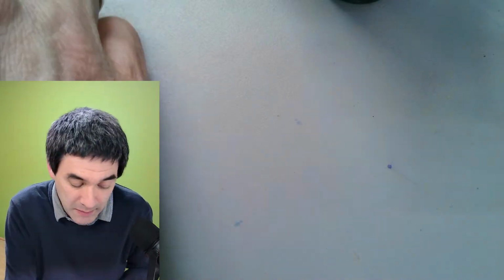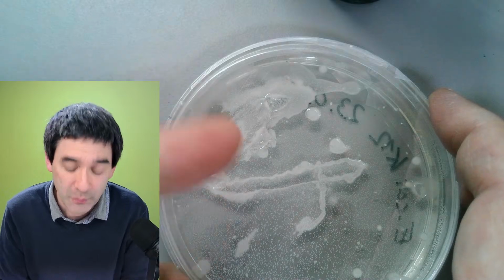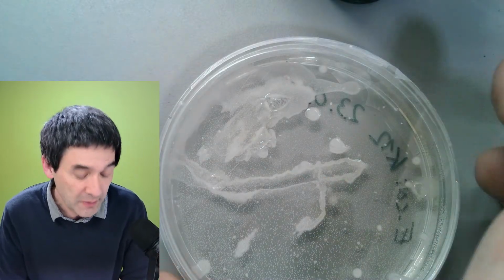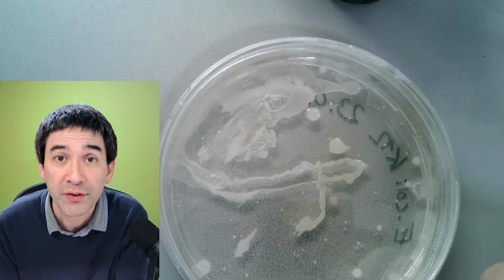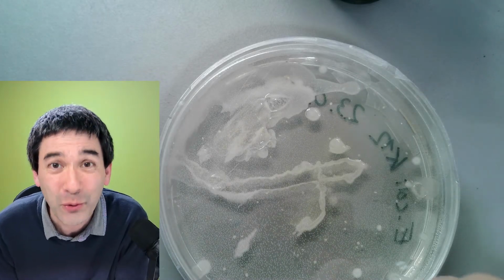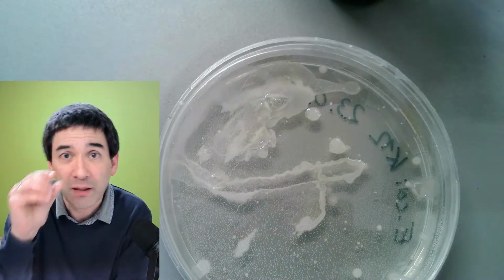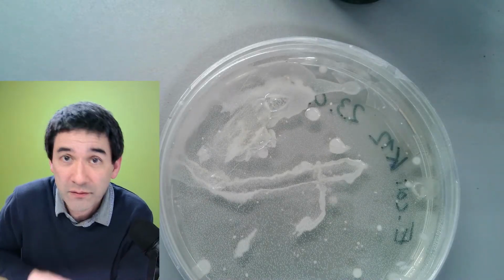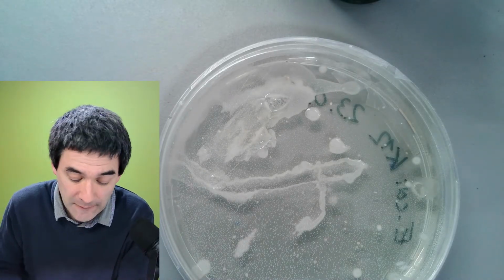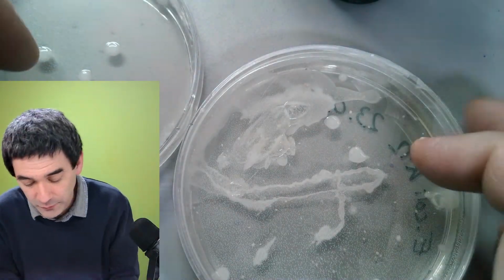I've been doing this a lot at university back in the day. Those here are mostly E. coli bacteria. I say mostly because there are also contaminants over here. But you don't want to mess around with bacteria, especially those where you don't know what they are. I have absolutely no problem with yogurt bacteria or things like that. And these E. coli bacteria actually also come from capsules that can be swallowed to regenerate the digestive system in case you have some kind of digestive issues. But those contaminants, I have no idea what they are, right? So we've got to be careful.